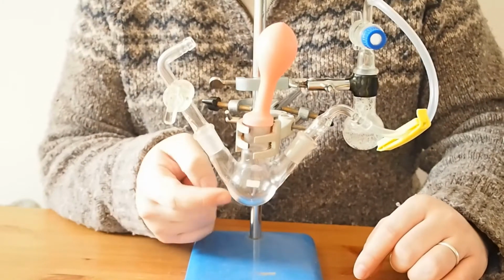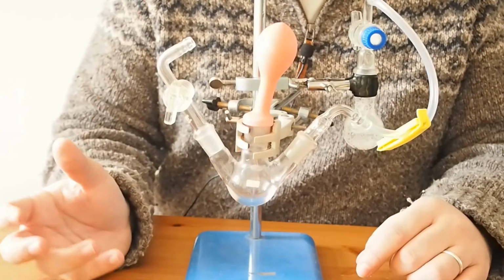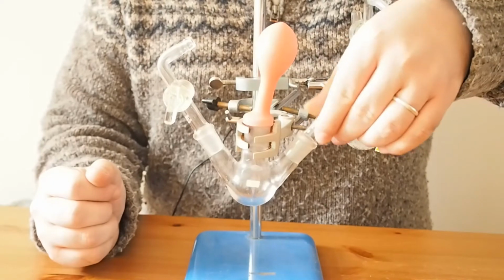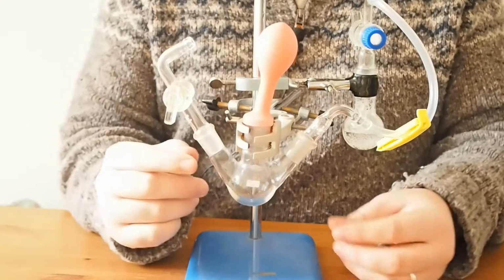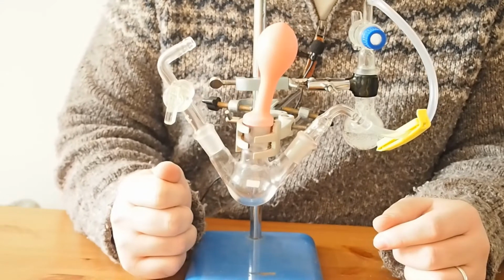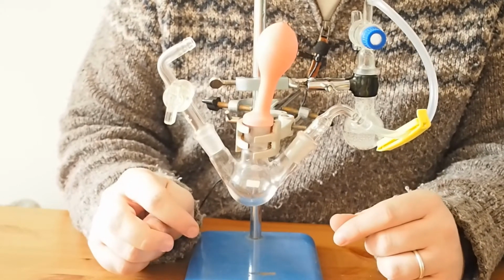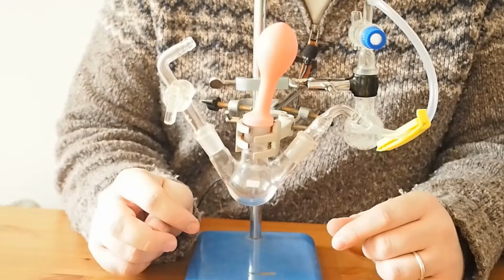It means I can carry out reactions in there, or possibly crystallize certain things that are sensitive to oxygen and not worry about them reacting with the oxygen in the air. Now I should mention here, this setup can do with a lot of improvements. I know that. But also, if there are any chemists among you, you might know that carbon dioxide can be used in reactions as well. And that's both a pain when you don't want it, but it's very exciting as a way to capture carbon dioxide as well.